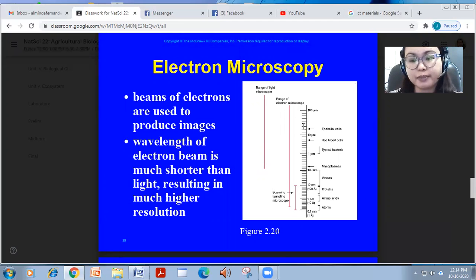And if you remember last time, these are the most high-tech microscopes we have so far. In the Philippines, we even only have one here, and as shown in the previous photo, it is just as big as a classroom.